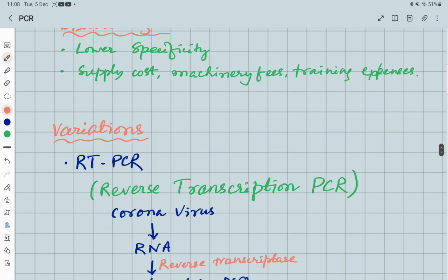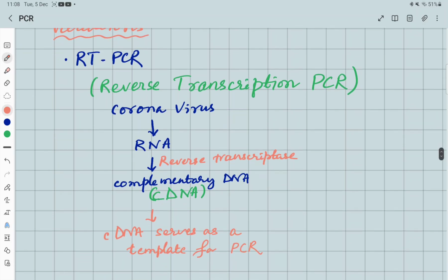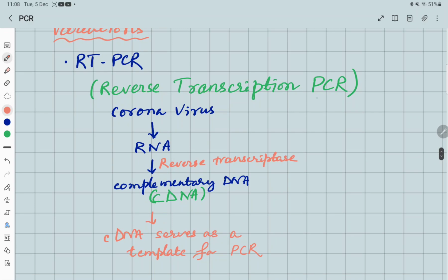Then variations of PCR. There are a number of variations, and one is reverse transcription PCR, and the other is real-time PCR. These two we'll discuss. Reverse transcription PCR is required because with PCR we can amplify DNA. So if we have a sample of RNA, then that RNA has to be converted into a complementary DNA by use of the enzyme reverse transcriptase. This is added in addition to the PCR technique. Once the complementary DNA is available, it can serve as a template for the PCR, and then the PCR process will follow.